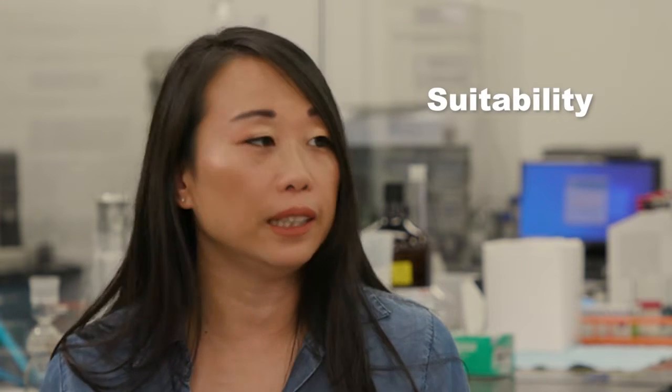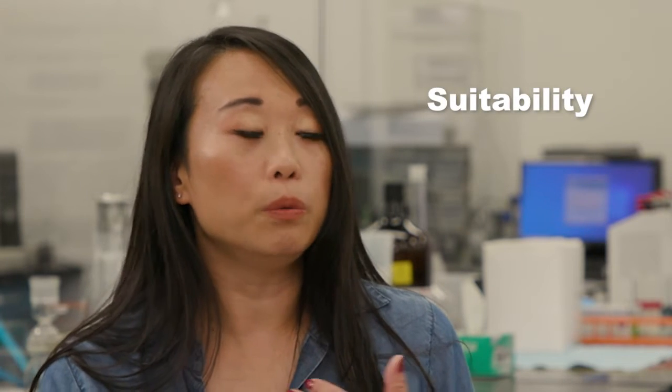And then you have to do 30 injections or 50 injections. It could go on forever, right? So how do you know if your instrument is suitable from point A to the very end? And that's what we do, is we make sure the system is suitable. We call that system suitability.